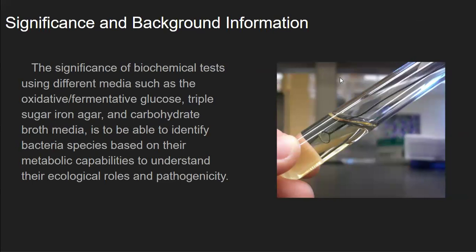Significance and background information. The significance of biochemical tests using different media such as the oxidative fermentative glucose, triple sugar iron agar, and carbohydrate broth media is to be able to identify bacteria species based on their metabolic capabilities to understand their ecological roles and pathogenicity.